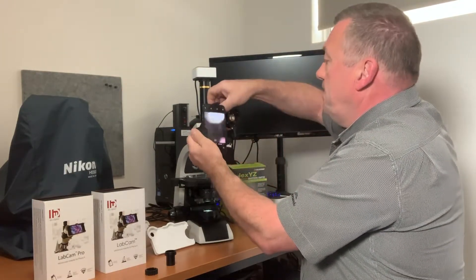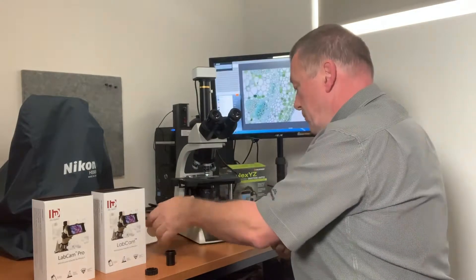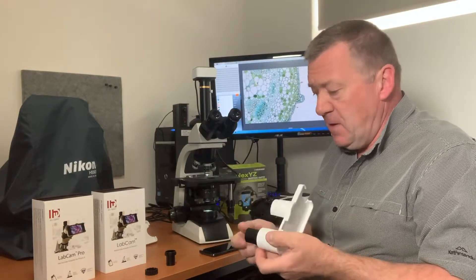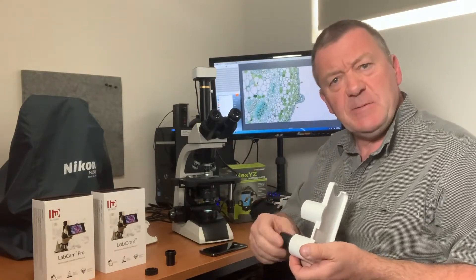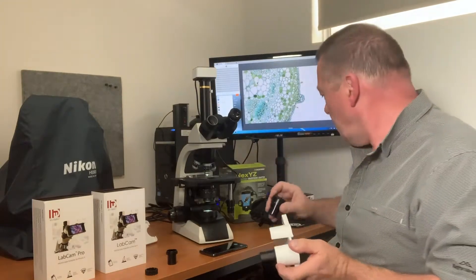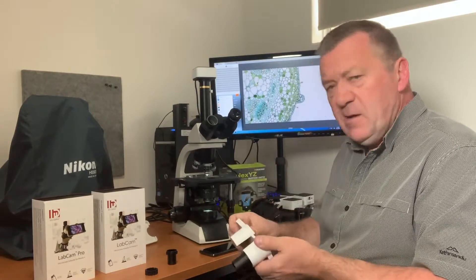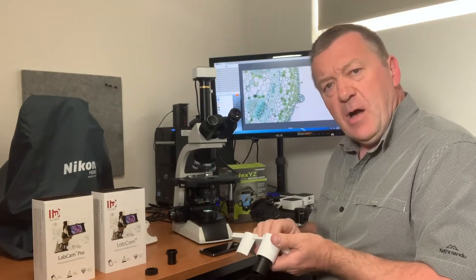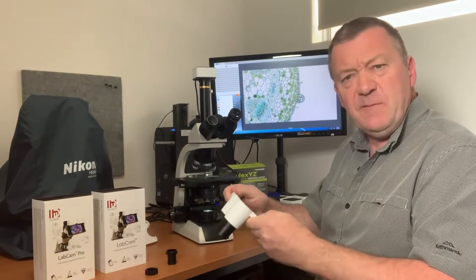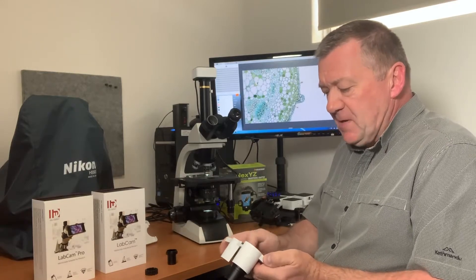Now I'm going to put the LabCam on. The Pro and the original are very similar — they both come with a 30mm adapter and a 23mm adapter. When using these, you don't actually use the eyepiece on your microscope; you take it out because they have their own ocular lens built into the adapter. It's a pre-molded shape adapter that only fits a specific model of iPhone — I'm using iPhone 10 — and it clips into the holder very nicely and snugly.